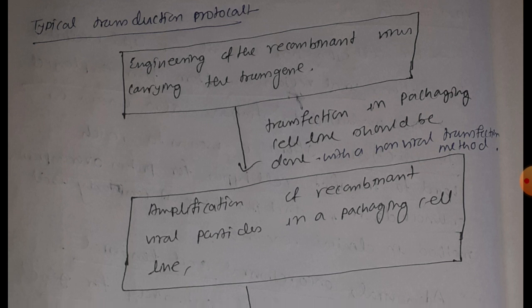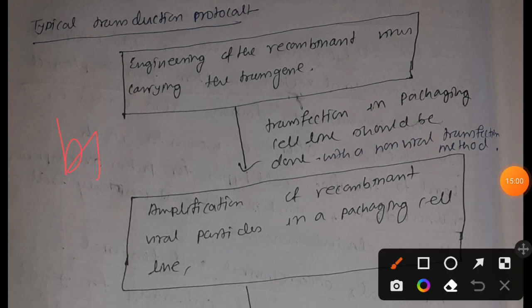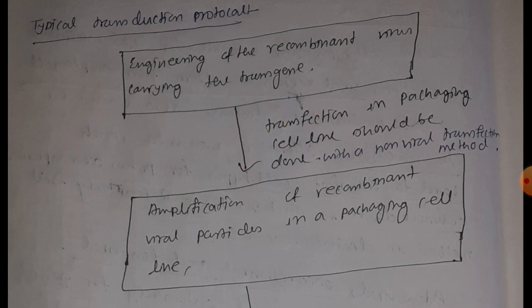Here it will be the integration of the transgene into the host genome, right. Then we discussed the disadvantages: it has immunogenicity, cytotoxicity, a laborious amount of work needed to prepare the viral vector, and it requires cost because of the development of a good biosafety system. Also it provides only a low packaging capacity.